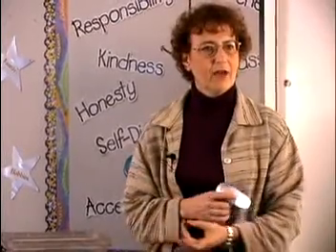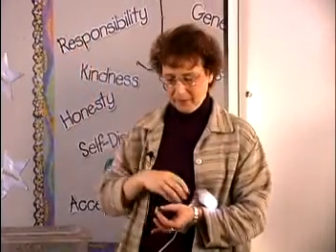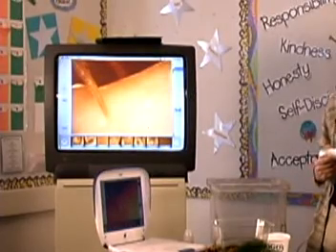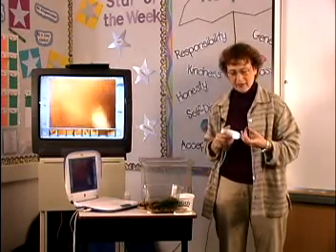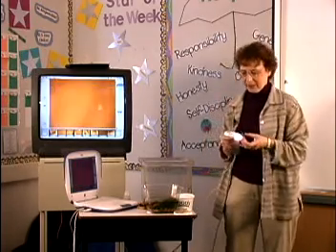The legs of the crayfish ended in two claws, like this. The legs on the fiddler crab end in what? Nicole? A point. It comes to like one big claw. And this has to do with the difference in how they move, which we can put them on the floor a little bit later and let you see.